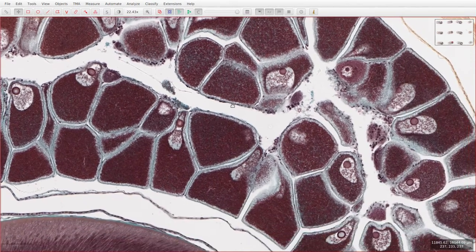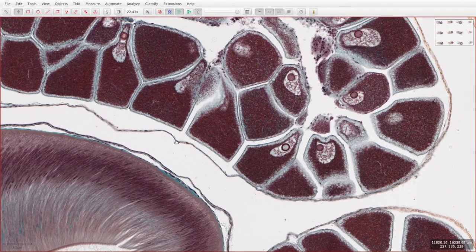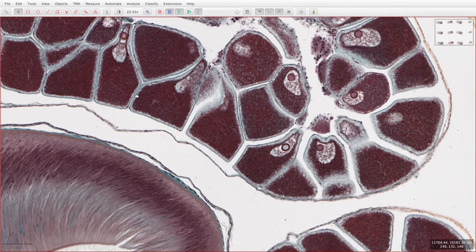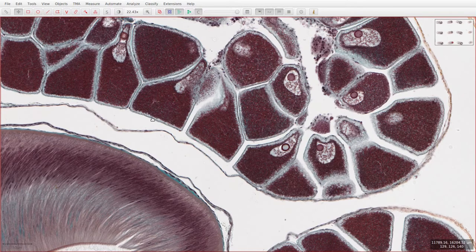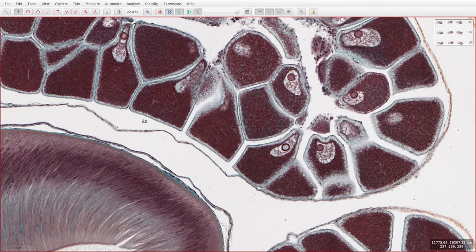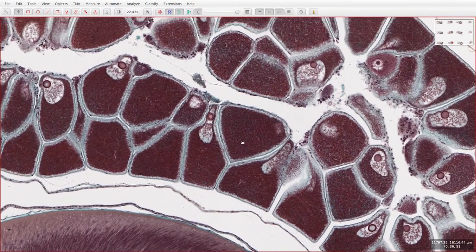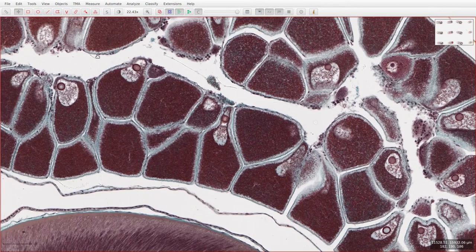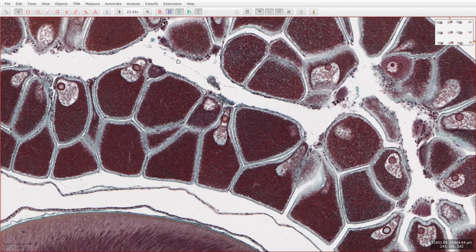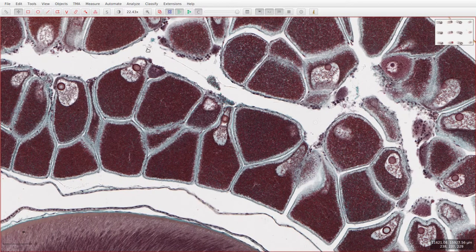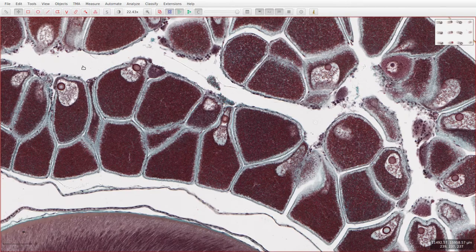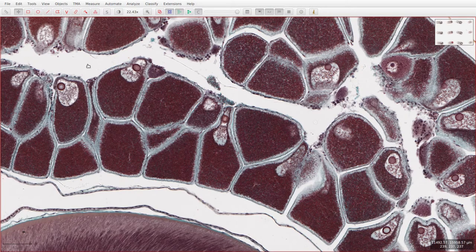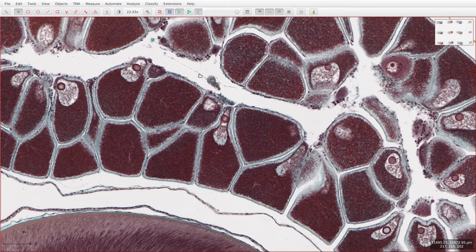The gap between the atrial epithelium and the epithelium covering the ovaries is called the gonocoel, and it forms a central cavity where the eggs will be shed and eventually leave the amphioxus via the atrial pore.